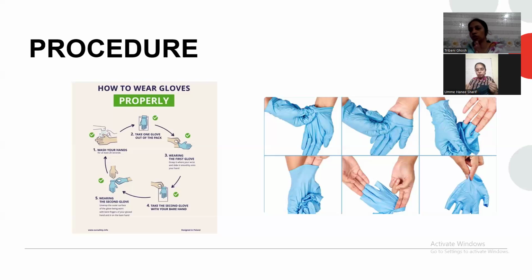No, do not do this, because hand sanitizer creates small pores in plastic like hand gloves. So you cannot apply hand sanitizer after putting on your gloves. You must apply hand sanitizer before you put on your gloves, and after you take off your gloves, you have to sanitize your hands, all right, for your safety. Okay. Now I understand.